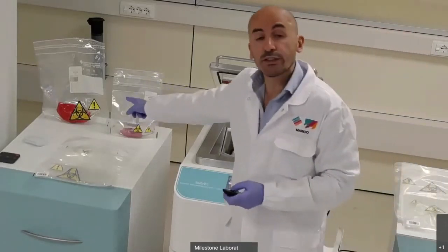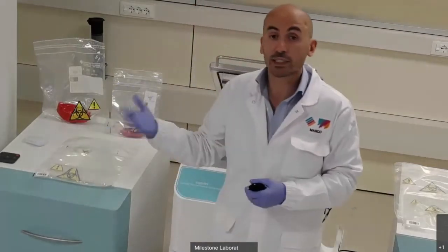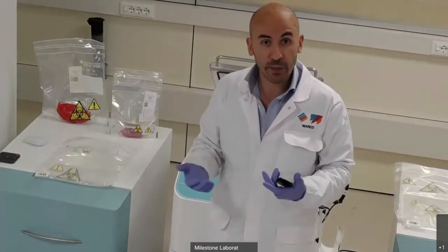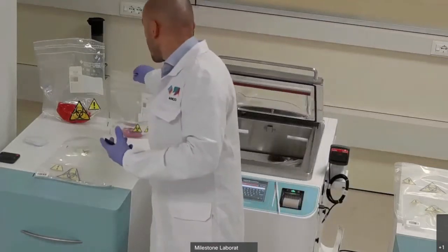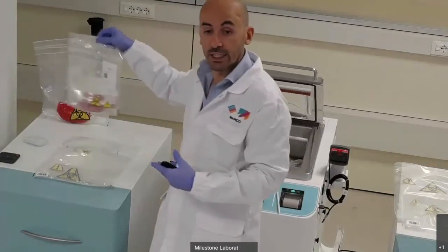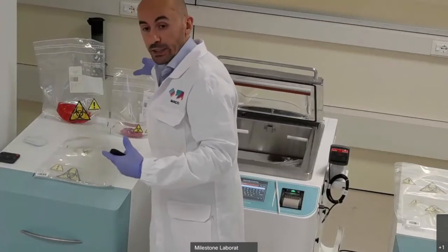Since we are dealing with fluids, I want to mention the other two bags available here, which are the so-called self-standing bags. The name is self-explanatory: they are bags designed to stand up vertically, even if they have specimen and fluid inside.